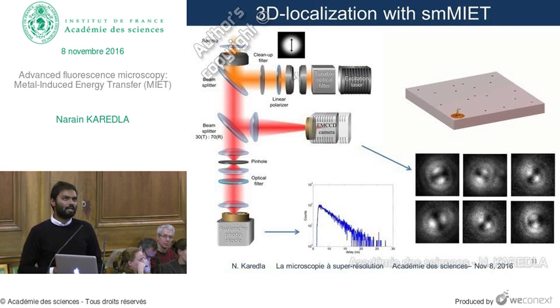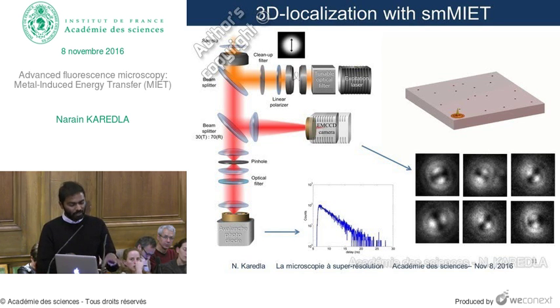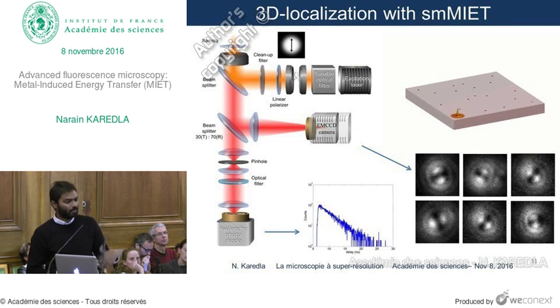And during that time, for cells at least, you don't have so much fluctuation in the cell. But if you want to record the temporal fluctuations at specific positions, then you can stay on this point and correlate, because the intensity varies in time. When you know where exactly you want to look, for example a complex which shows some dynamics in the microsecond to millisecond time range, then you can sit on a point and take a correlation in time. Then you will get all the information that you want on the microsecond to millisecond time scale.